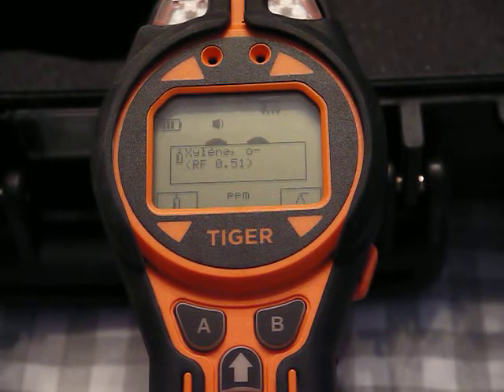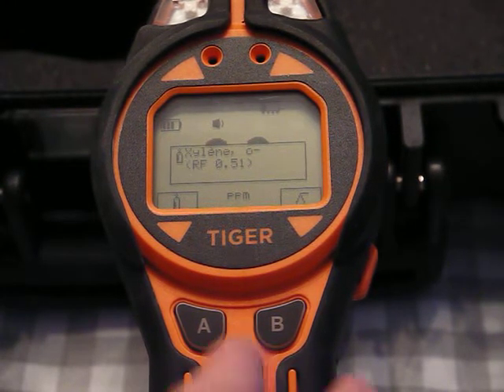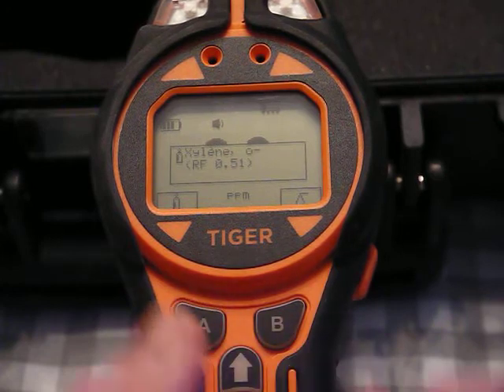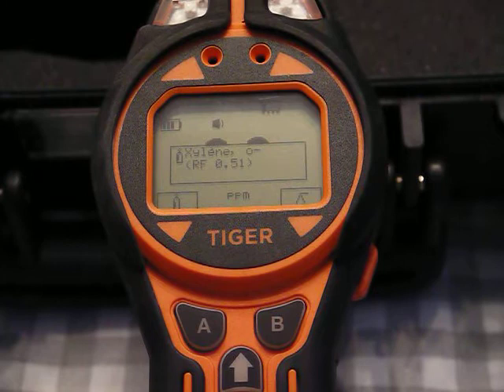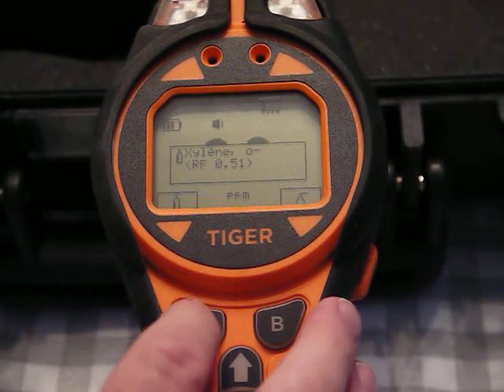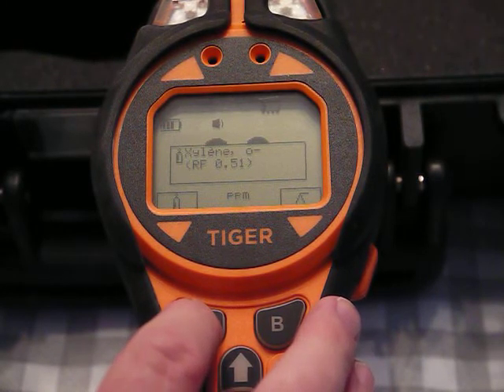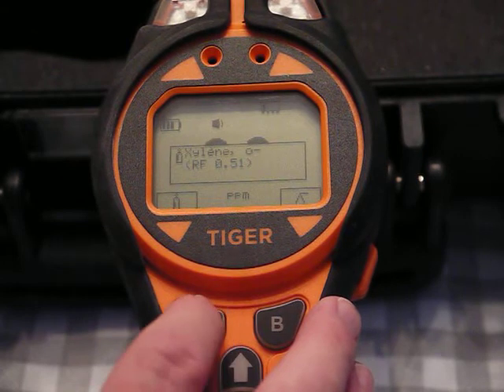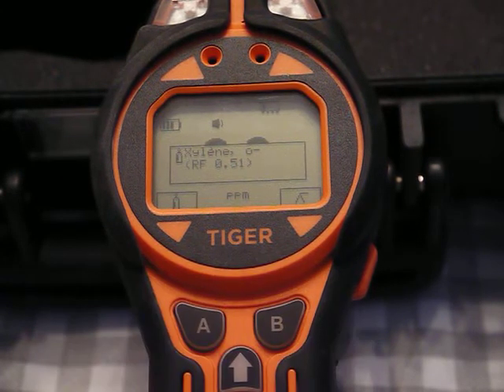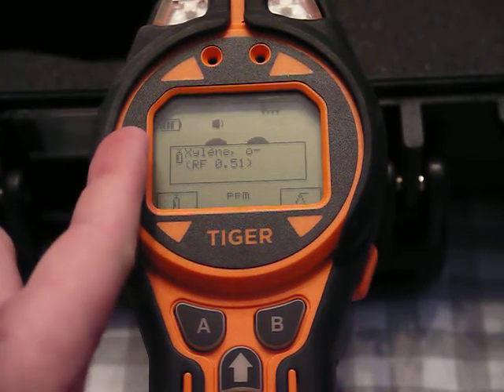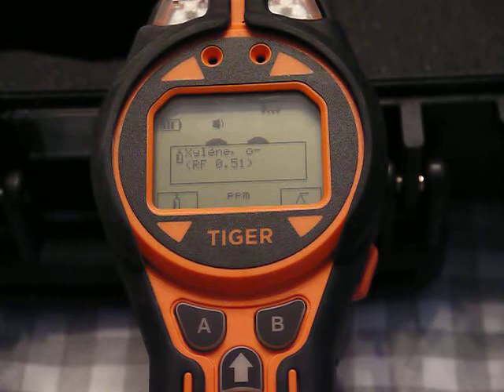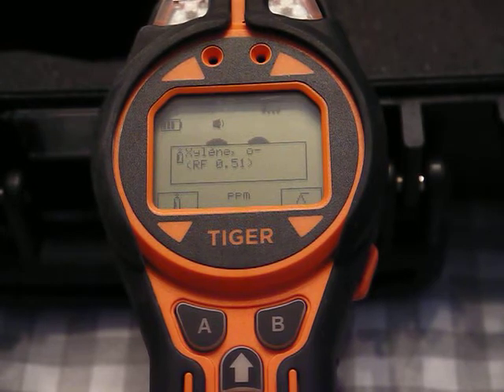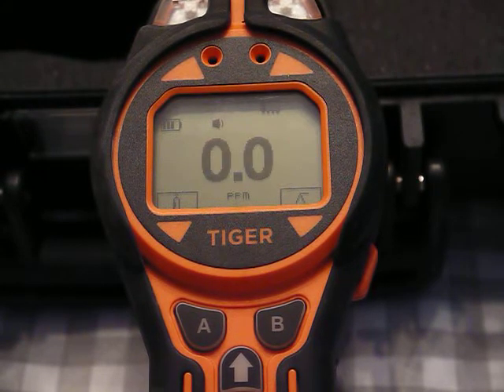This is really powerful — if you have one VOC present you can enter the response factor and read it directly. In some cases you may just be looking to screen soil samples, water samples, or air samples, so we use a response factor of 1, or basically isobutylene, because you're calibrating with isobutylene. If you set this to isobutylene it's a response factor of 1 — this is called total VOC monitoring.